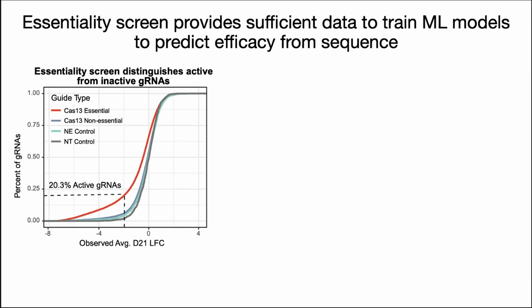The way people typically quantify how well the guides are working is to calculate this LFC, log fold change. So this is the log difference in the counts between the initial pool of guide RNAs and what you have at, say, day 21. You can just do short-read sequencing there because these guides are only 23 base pairs. So this is one place where it is still okay to do short-read sequencing, I think.